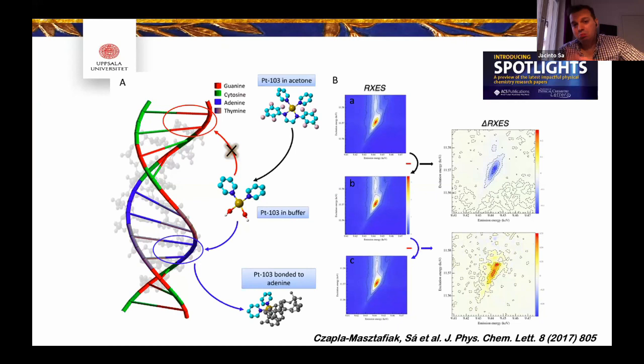I mean, here, like I said, having the ability to do this at the synchrotron, it was quite easy to get the full map and do it. But it becomes important when you're going to bring this to the lab, and that's what I didn't mention: we are building these spectrometers in the lab, and there of course running RIXS is tricky. And this is an approach because you cannot really run HERFD because you don't have a scanning beam. So that definitely is something to look at.